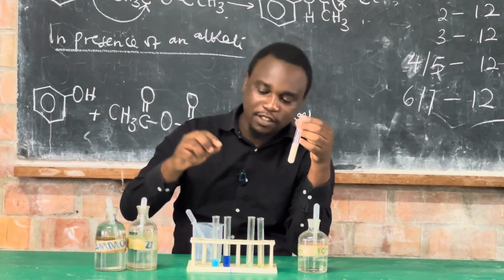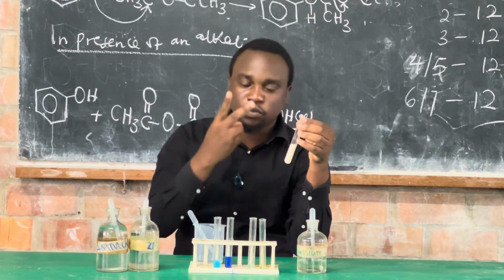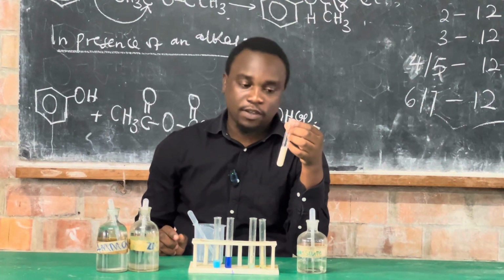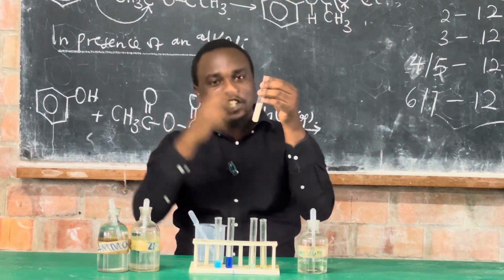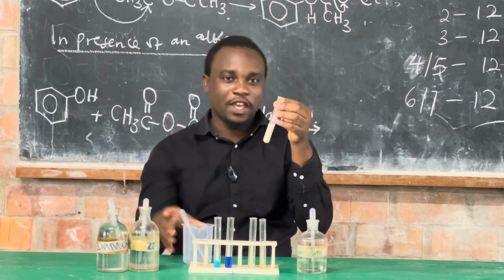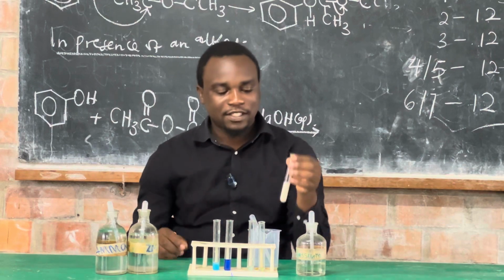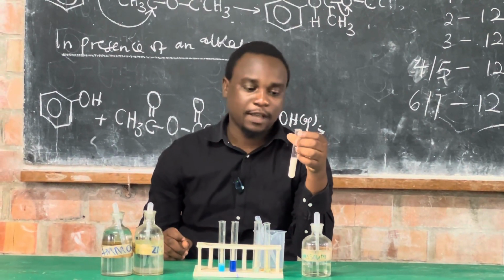So when I add potassium iodide to copper 2 ions, we form two compounds: iodine solution and copper 1 iodide. Because of the iodine solution formed, the white precipitate initially is not observed. But when I add sodium thiosulfate, which reacts with the iodine, then the white precipitate can be observed. So this addition of potassium iodide acts as the confirmatory test of copper 2 ions in the laboratory.